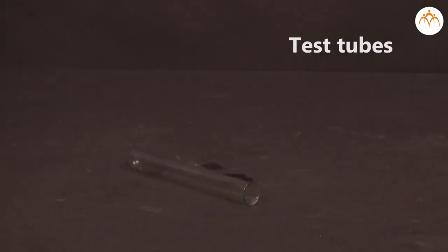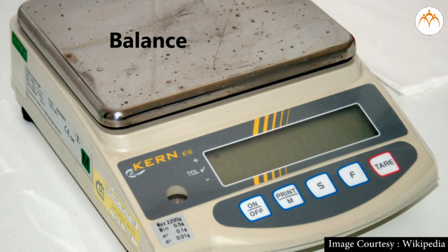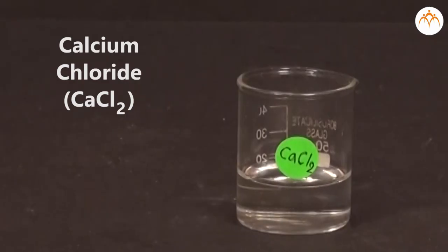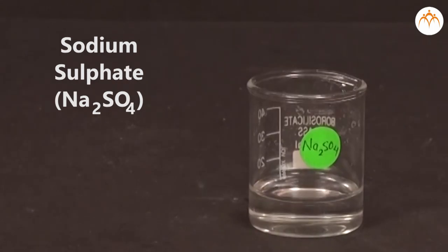We will use a conical flask, test tube, rubber cork, and balance for this experiment. We also need solutions of calcium chloride and sodium sulphate.